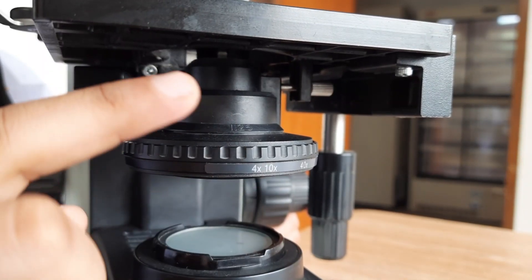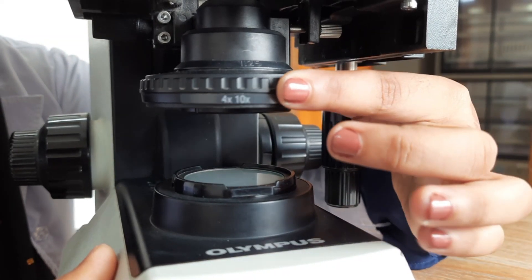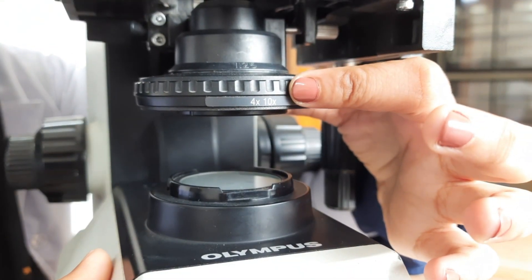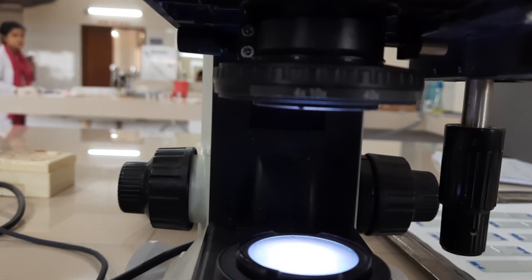The condenser is located beneath the stage and is responsible for the first step of focusing light onto the specimen. It can be adjusted to control the amount and angle of light that reaches the specimen.